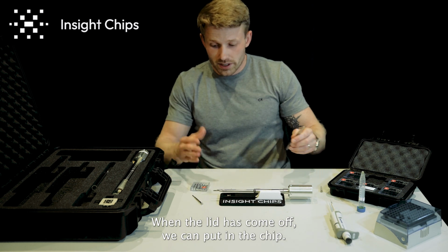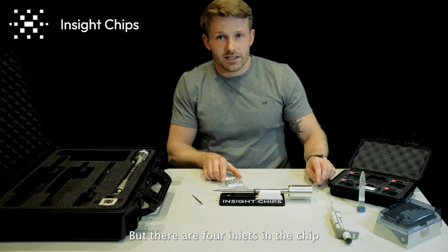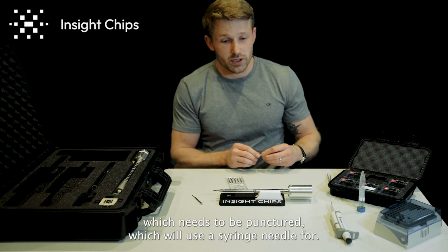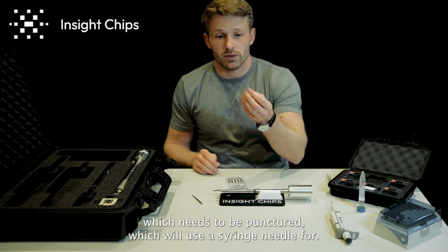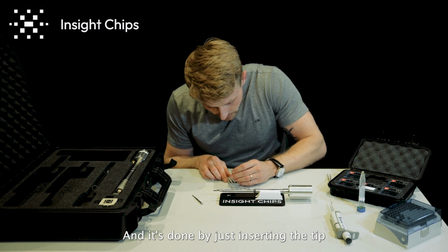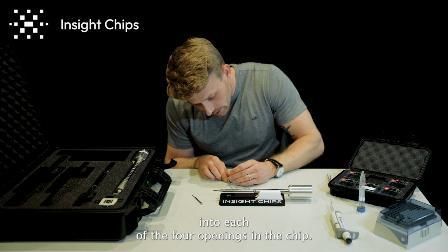When the lid has come off, we can put in the chip, but there are 4 inlets in the chip, and they are each sealed with a thin nitride membrane, which need to be punctured, which we'll use a syringe needle for. And it's done by just inserting the tip into each of the 4 openings in the chip.